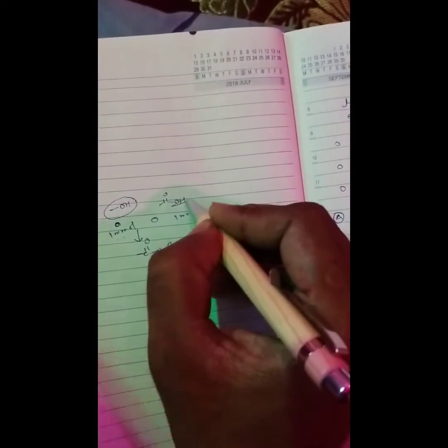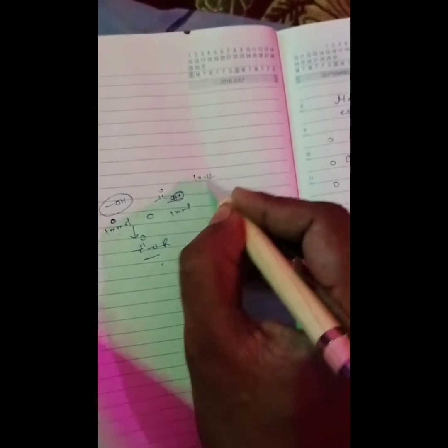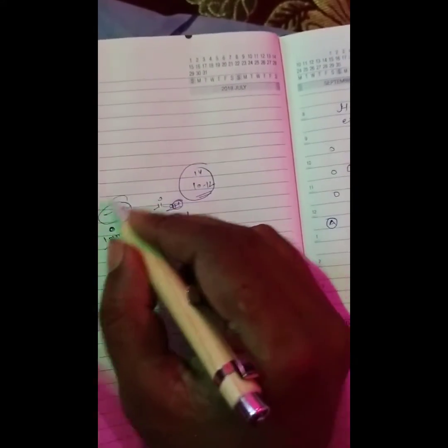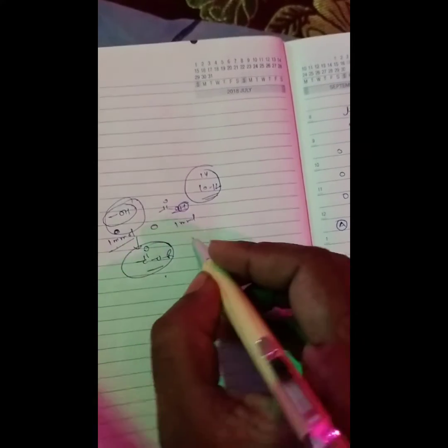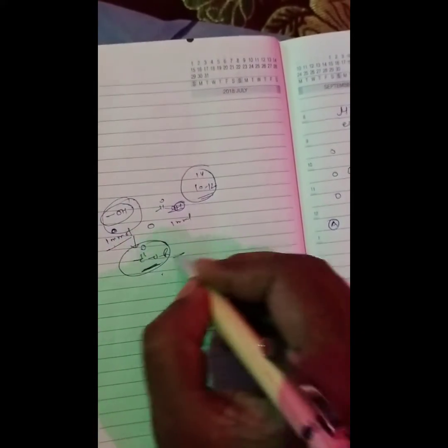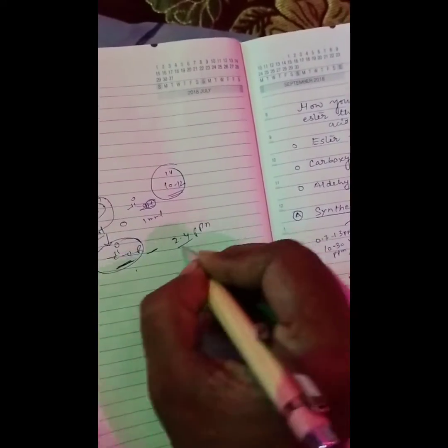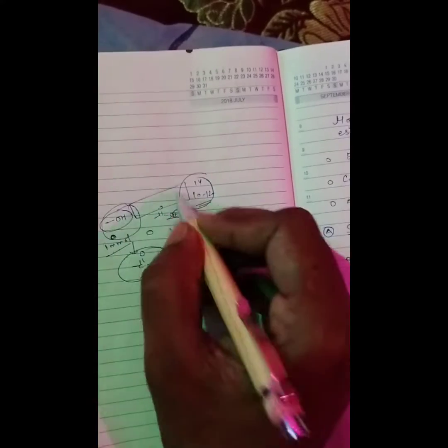The COOH proton appears in the region of 10 to 12 ppm in proton NMR spectroscopy. So first of all you should know the proton NMR spectra of the starting materials, so that when the product is formed, a new peak will appear for the ester, at 2 to 4 ppm. This new peak appears while the starting materials are consumed during the synthesis.